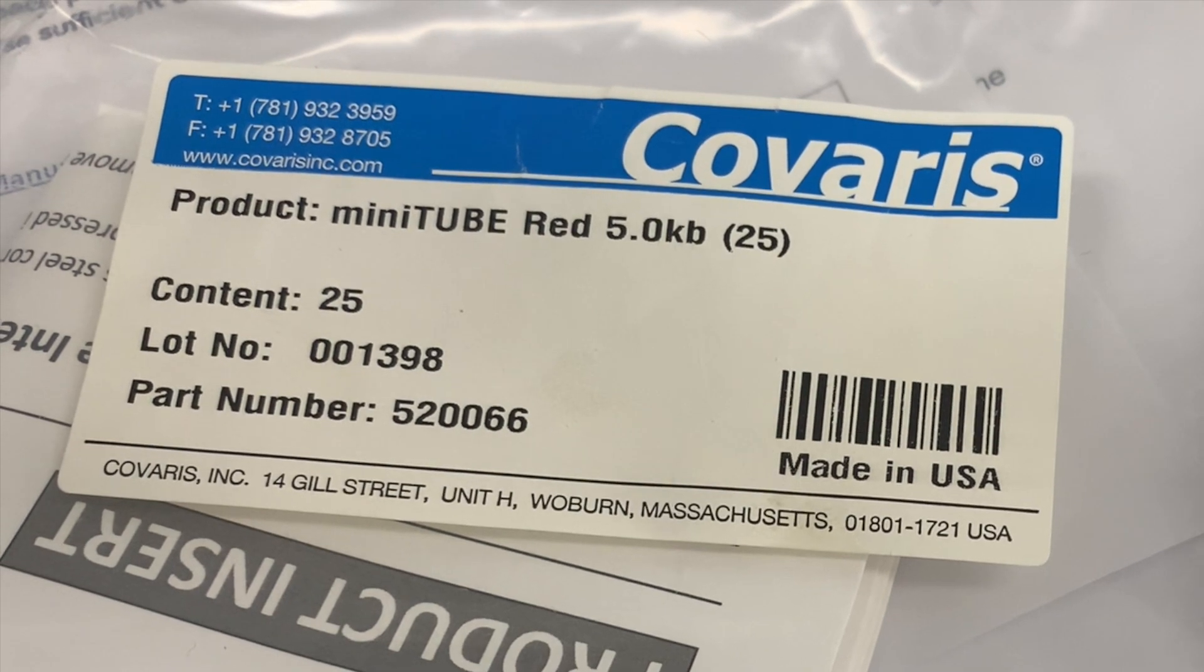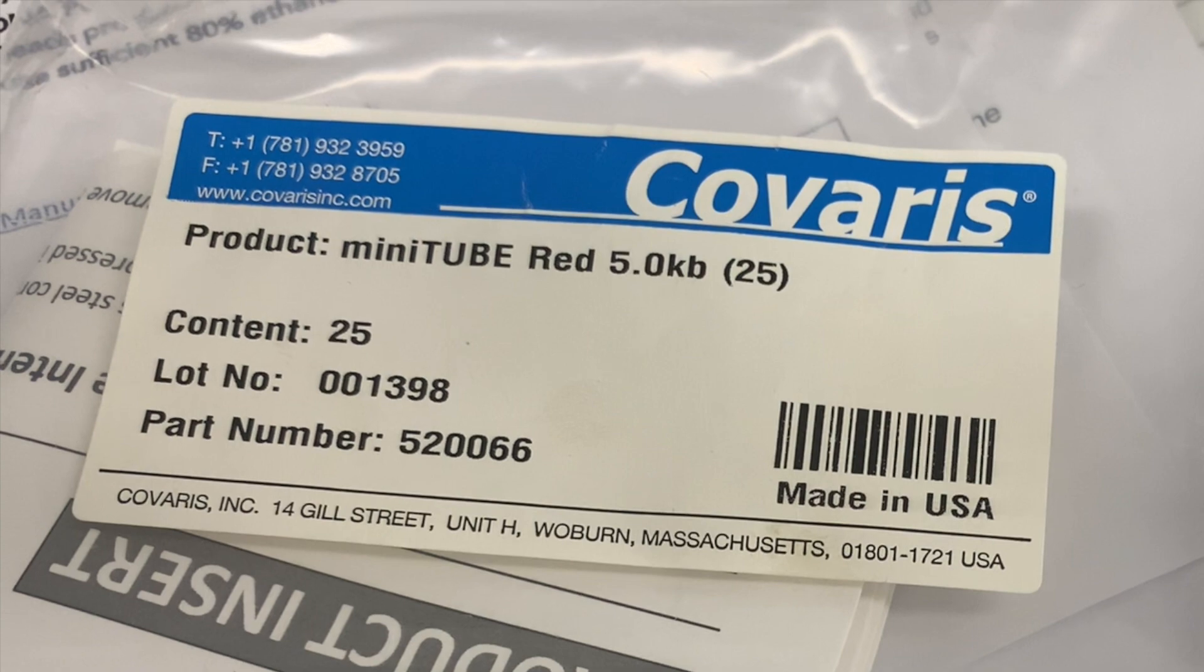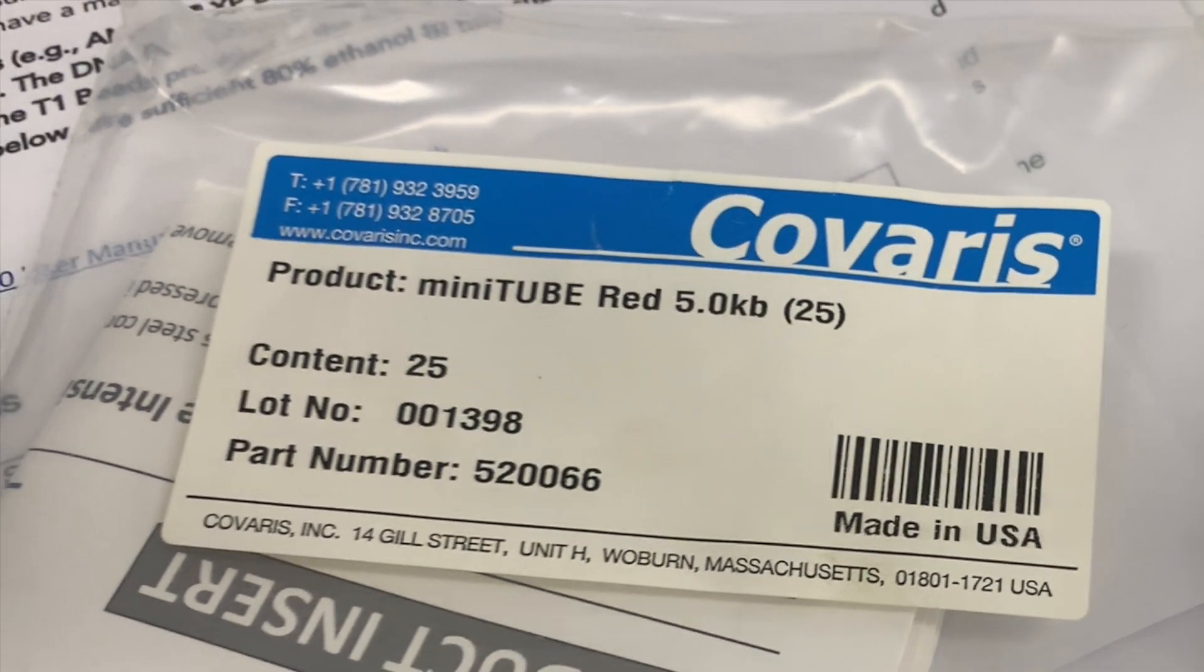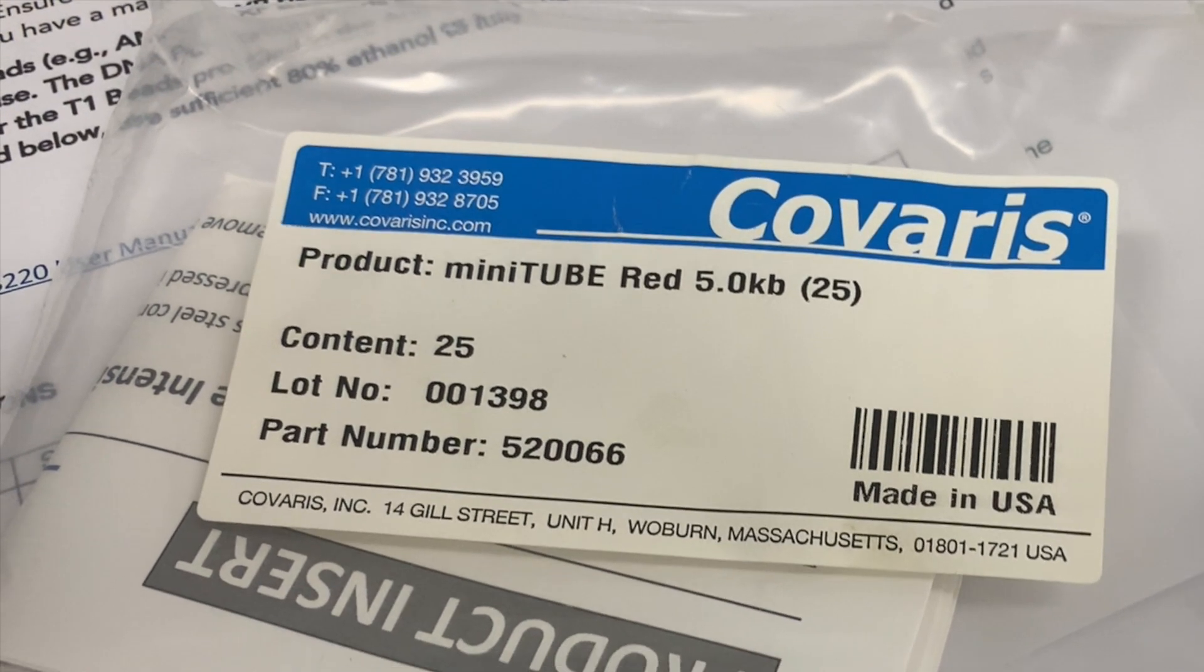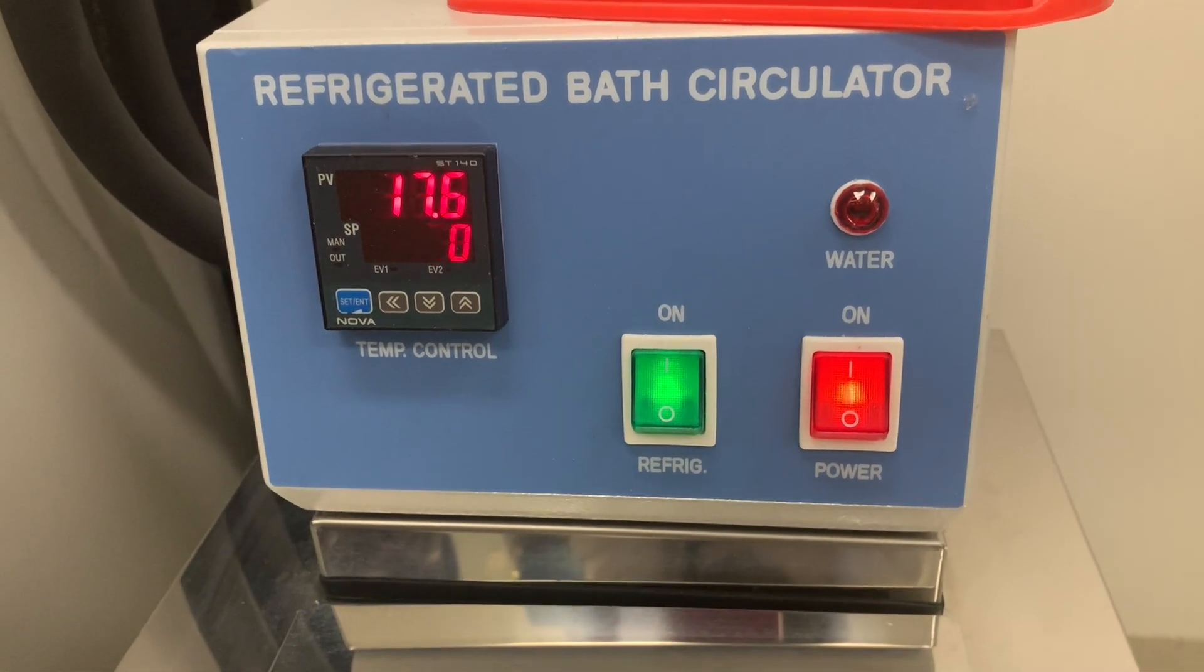Depending on the sound energy, DNA can be broken into different sizes. For example, some acoustic devices can break DNA into 100 base pairs up to 5000 base pairs, and others can do very long pieces at 6 to 60 kilobase pairs.